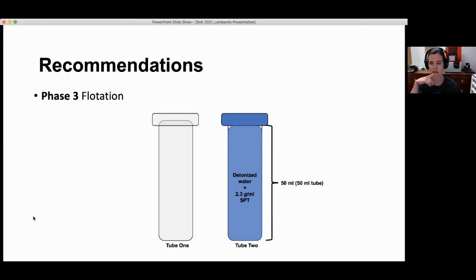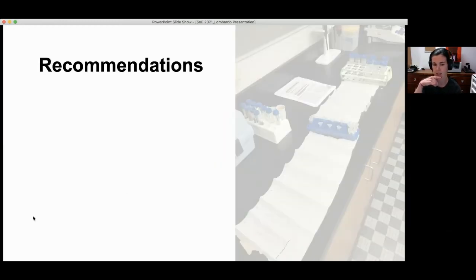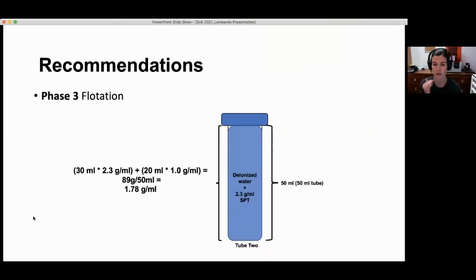So if you just click through, Tori. After completing this process a time or two, I had a suspicion that the liquid's specific gravity may not be enough to sink the phytoliths all the way to the bottom. If you do calculations on this, according to phytolith specific gravity that ranges from 1.5 to 2.3, we have a potential problem here with the specific density of our liquid.